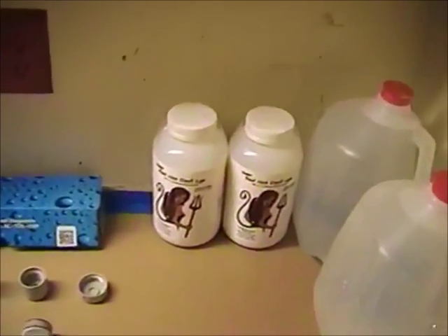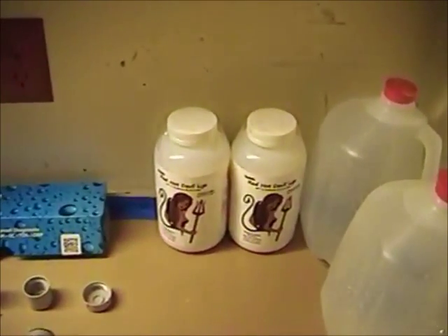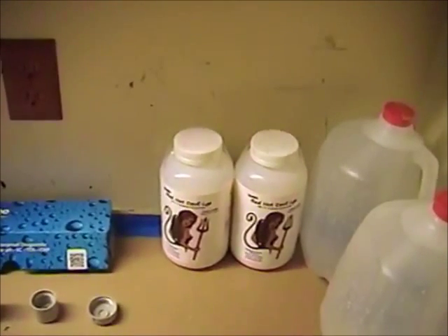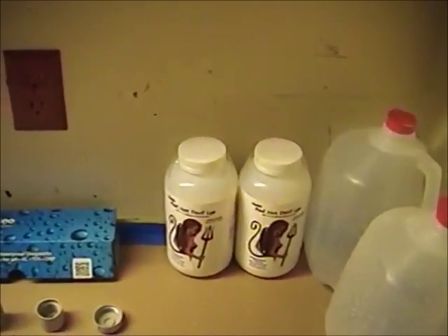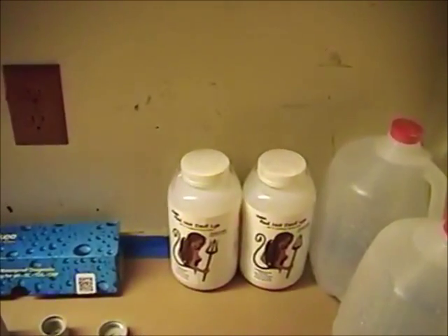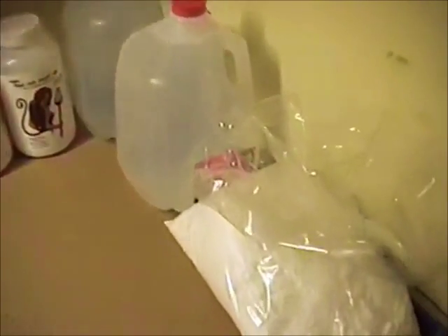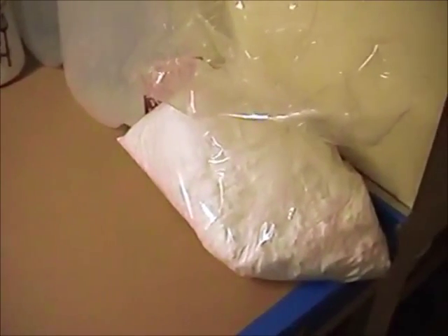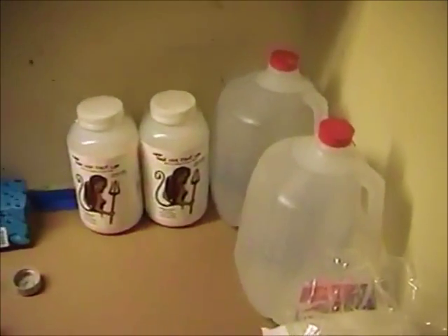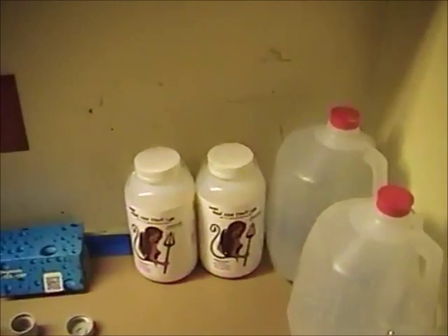The third thing I have back here is sodium hydroxide. The sodium hydroxide is what we're going to add to precipitate some of the metals from the solution before we use our formate to precipitate our silver from solution. I'll go into the theory behind that in just a moment.